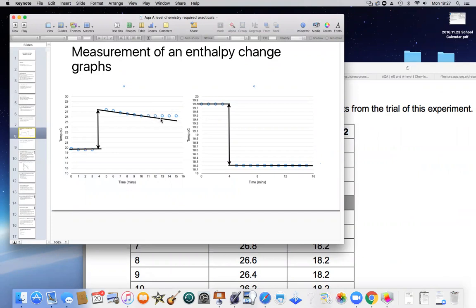This is a little bit of a surprise over here. If you have a look at the results on the graph, you can see that they are leveling out. You wouldn't expect them to level out until the temperature drops significantly more, because we're above the initial temperature here. So as long as the surrounding area has stayed the same temperature as before, around about just below 20 degrees, you'd expect this to continue to drop off. So I've drawn the line of best fit to reflect the trend that we are expecting.